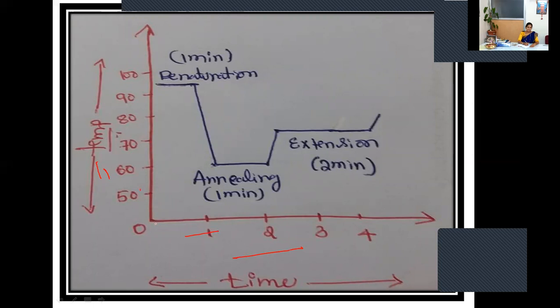So within this particular 1 minute, what happens in the PCR mixture? Denaturation will be happening within the 1 minute. What's the temperature?